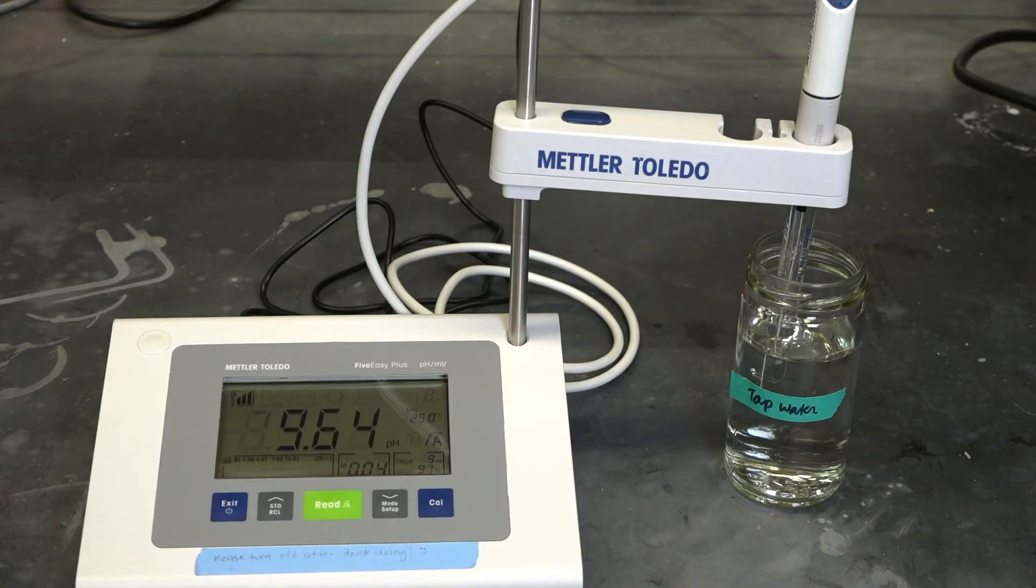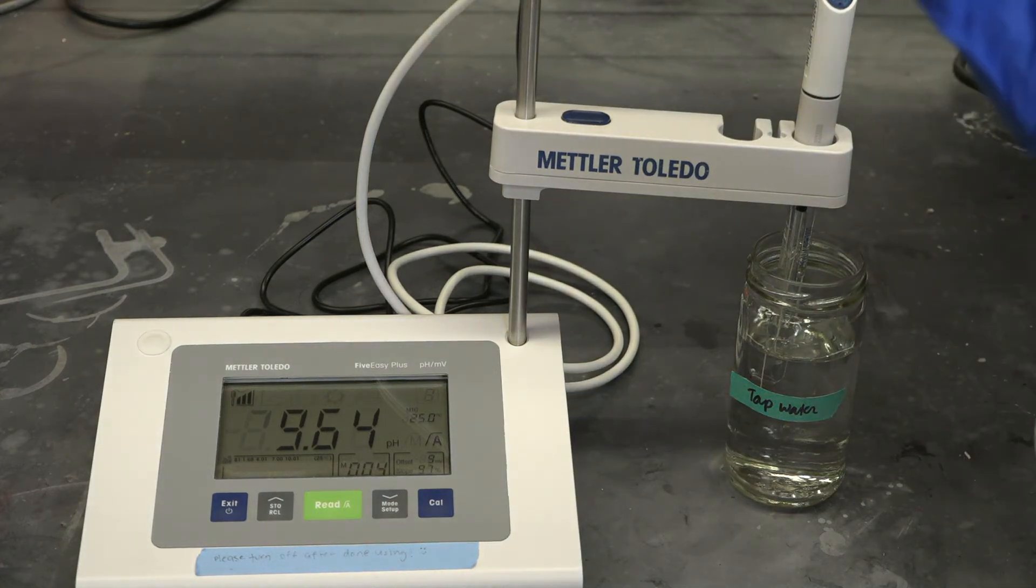And you should now be able to see the pH measurement on the display panel. In this case, it's 9.64. Wow, that's some pretty basic tap water.